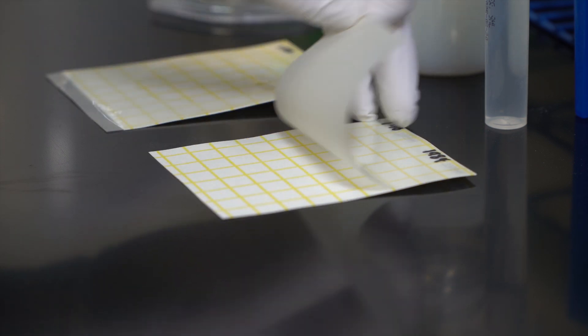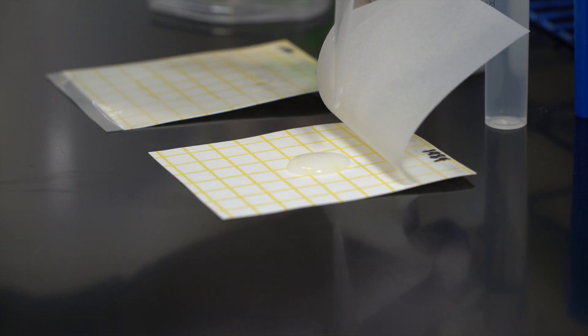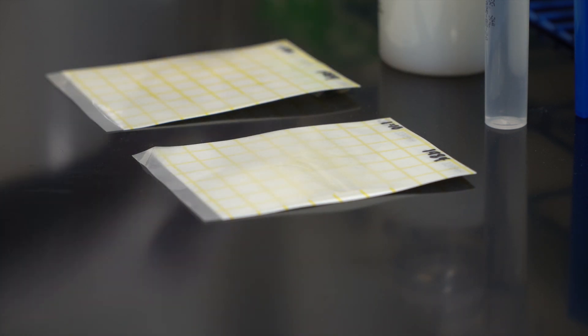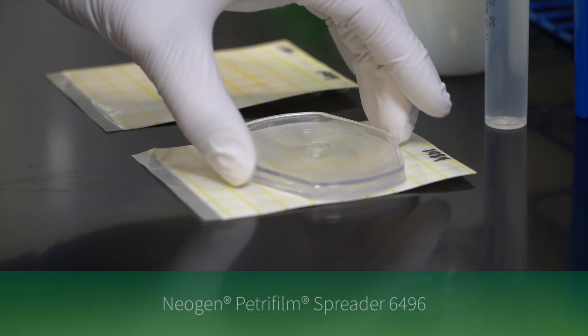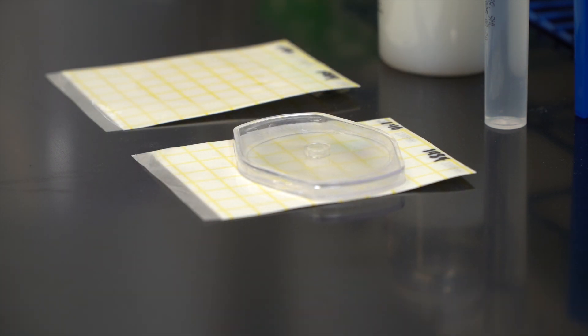To inoculate, lift the top film and dispense one milliliter of the prepared sample onto the center of the bottom film. Drop the top film and place the Neogen Petri Foam spreader with the recess side down over the sample. Press gently to distribute the sample evenly.